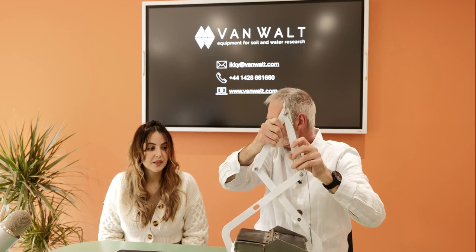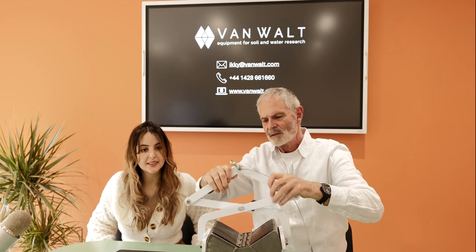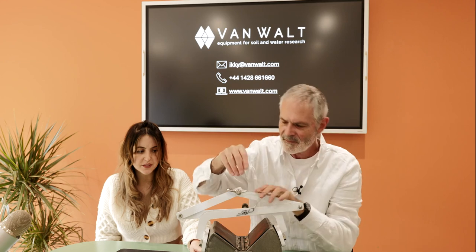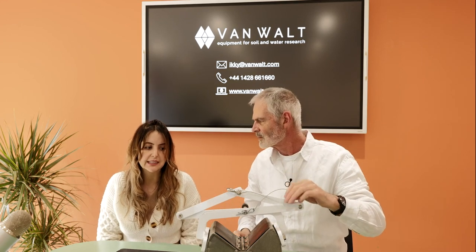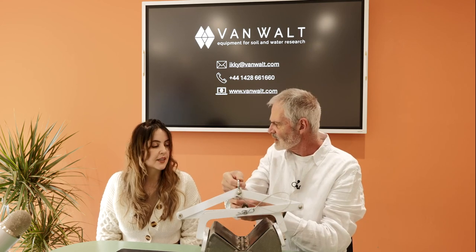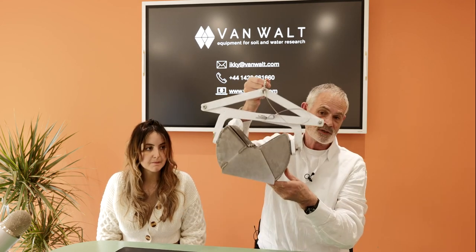It's a 2.8 litre capacity. 2.8 litres, so it's a very small one. They're available in all different sizes, and I'm just going to put this little... This is a standard and the most popular size. They get quite heavy after that. I think after this size it goes up to about 6 litres and a little bit beyond. It gets pretty heavy, I think. This one is already 8 kilos.